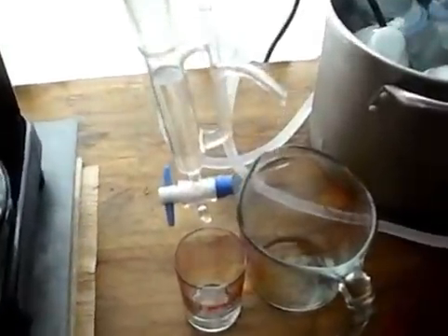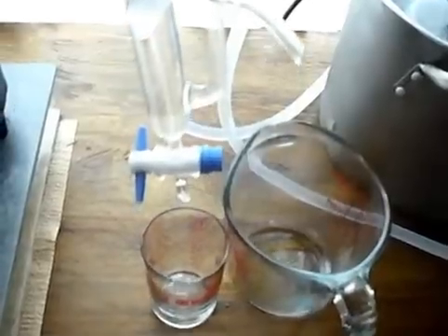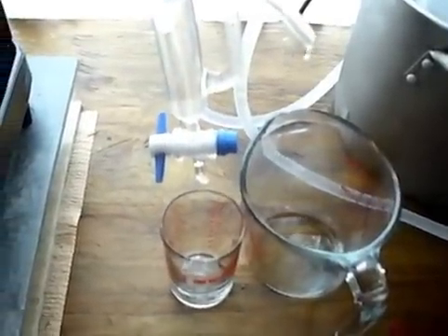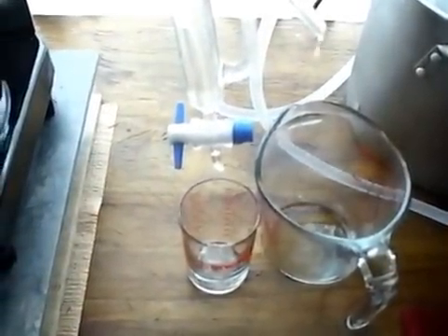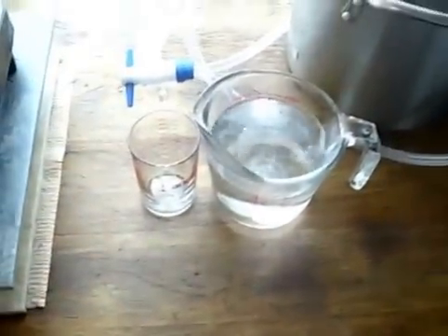Look how much hydrosol is coming out now — that's all I did, just wrap the biomass flask. You can see in the condenser quite a bit coming through. I've got about 500 milliliters of hydrosol collected and a very small oil layer visible.